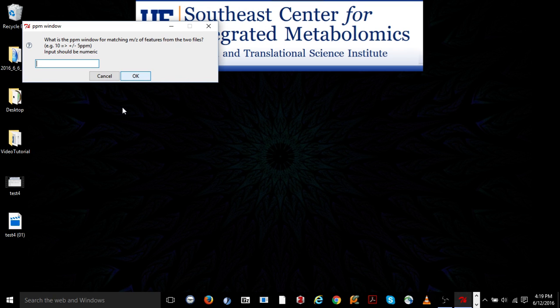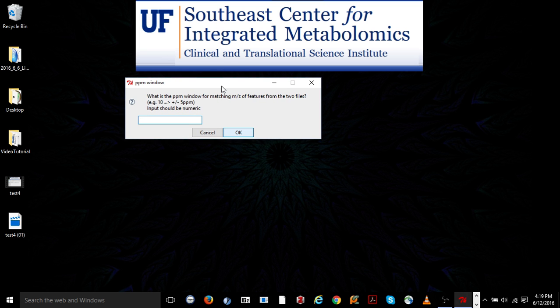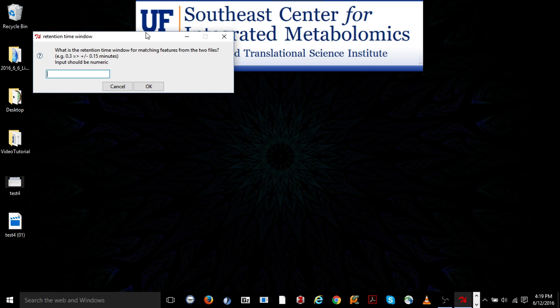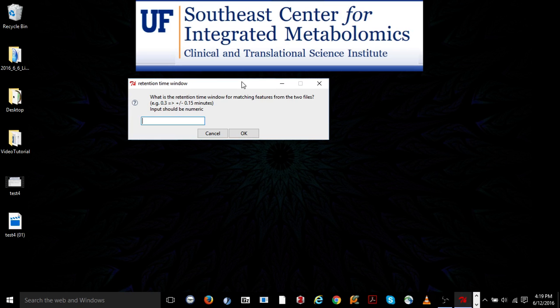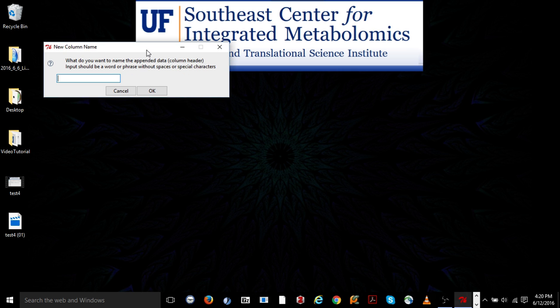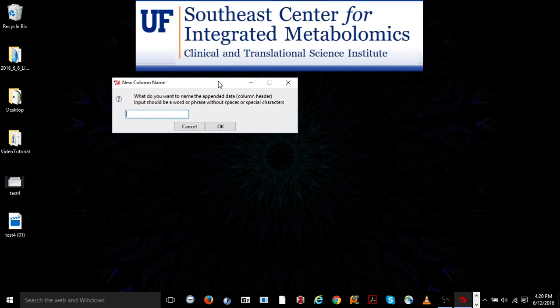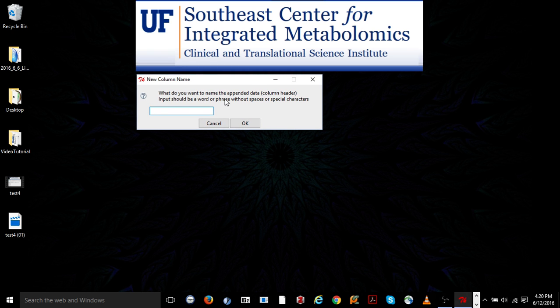Now, it asks for the PPM window. So, when it's combining the different files, it's going to be looking for features that have the mass to charges within a PPM window. So, in this case, I'll put 10. So, within a 10 PPM window. And their retention times also have to be within a window. So, in this case, I'll put 0.3 for plus or minus 0.15 minutes to combine these features. Press OK. And the final input is what do you want the name for your appended data. It's both going to be included in the name of the file it saved and as the column header. So, in this case, I'll say MS dial ID. We'll press OK.